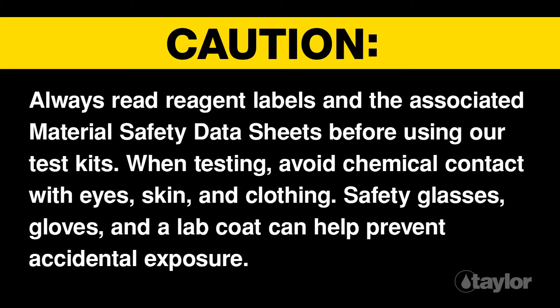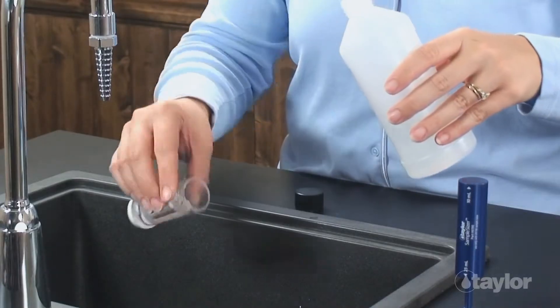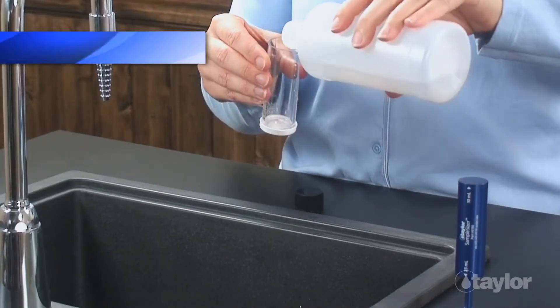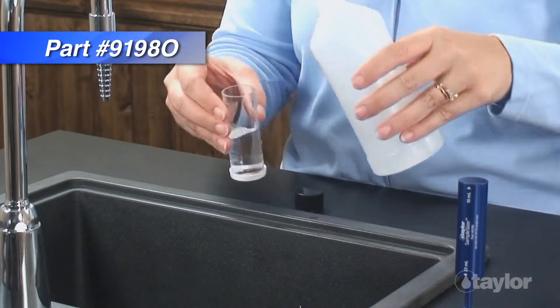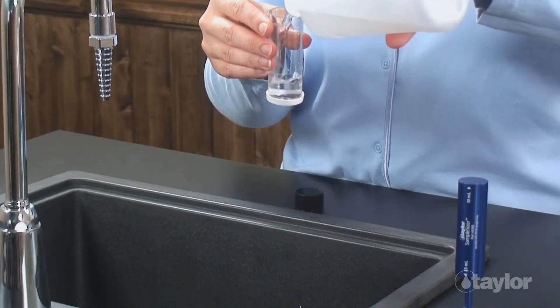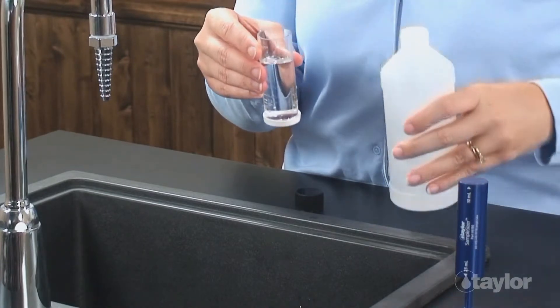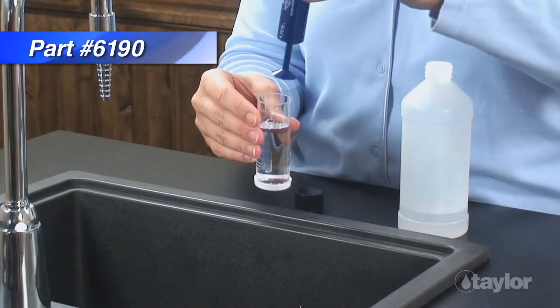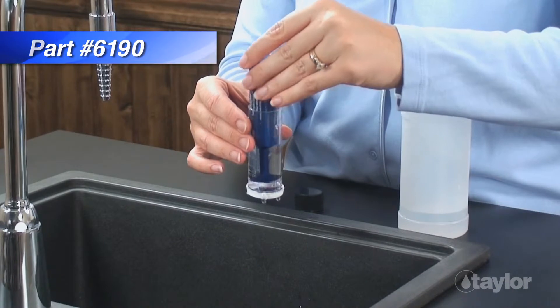Using a drop equivalency of 10 ppm, rinse and fill the 25 ml sample tube to the 25 ml mark with the water to be tested. The Taylor Sample Sizer, shown here, is a great tool for getting accurate measurements every time.